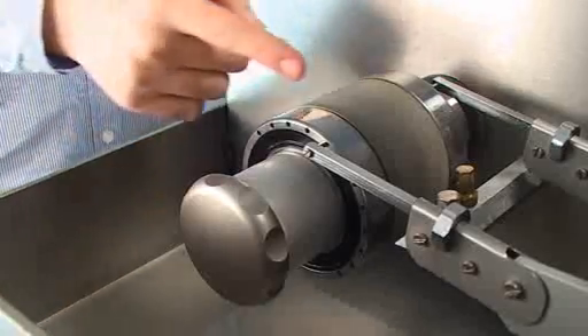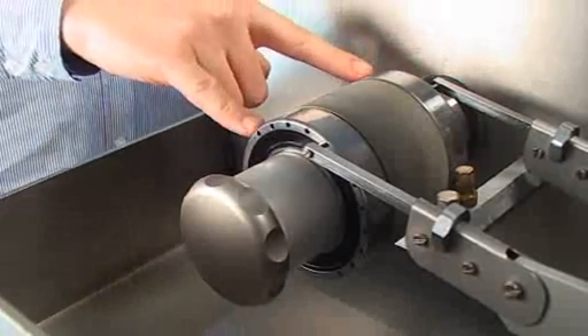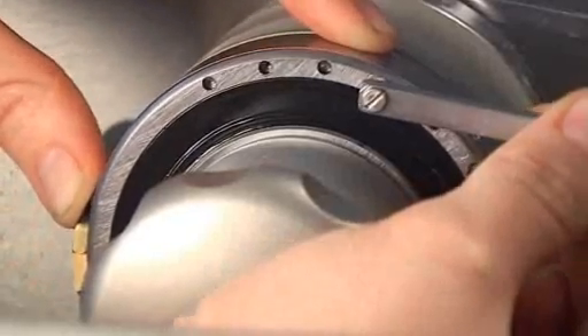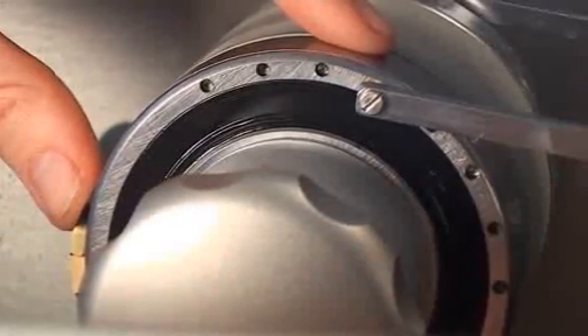The grinding section of the machine consists of the grinding unit with a diamond roller flanked by eccentric ball bearings. The adjustment of the grinding level is very easily carried out by changing the setting of the outer ball bearing. Changing from one hole to the next will result in a grinding thickness difference of 5 microns.